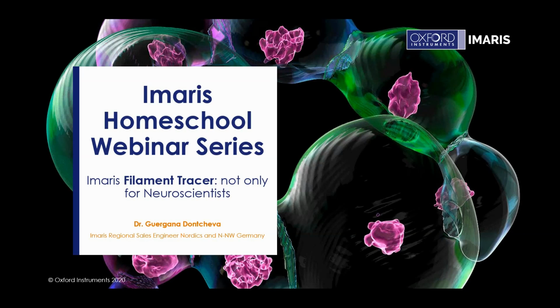This and next week's webinars are devoted to our Imaris Filament Tracer module, where today I will introduce you to the core functionalities and applications, and next week my colleague will dive deeper into the more complicated cases. And also, hopefully by the end of this webinar, I will be able to show you and convince you that the filament tracer can be used in many different fields of research and not only neuroscience.